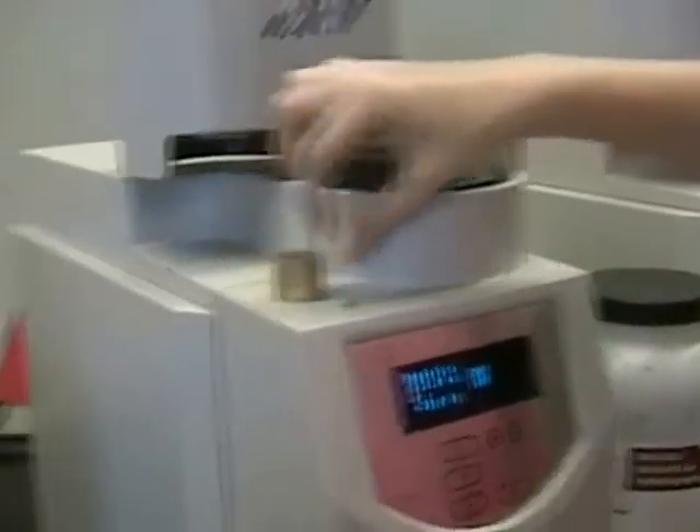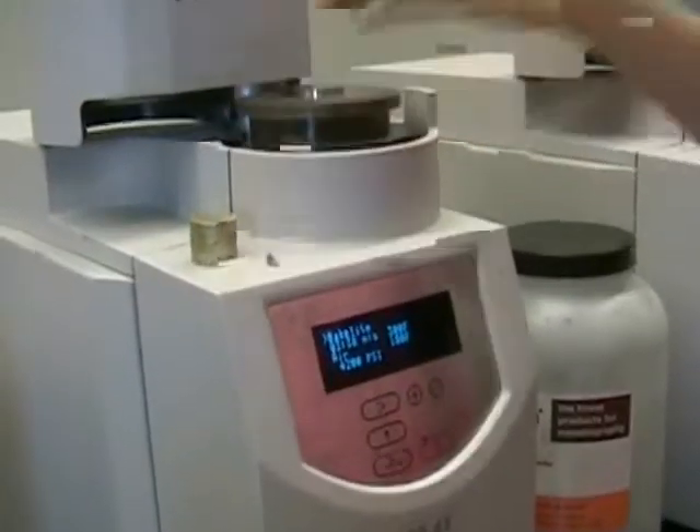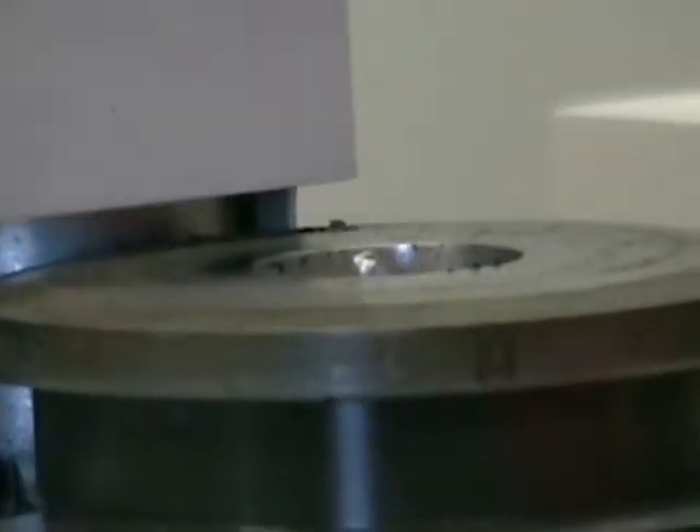Large samples are easy to hold, but small samples need to be mounted. There are two types of mounting processes we'll cover. Hot mounting, usually done with bakelite, is used for samples that can withstand heat and pressure without changing the microstructure. The sample cut with the diamond saw is too small to hold on a belt sander, so we have to mount it in bakelite.